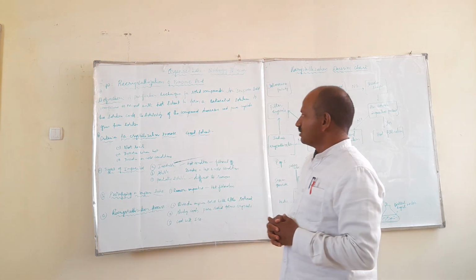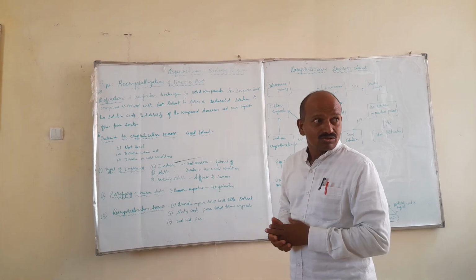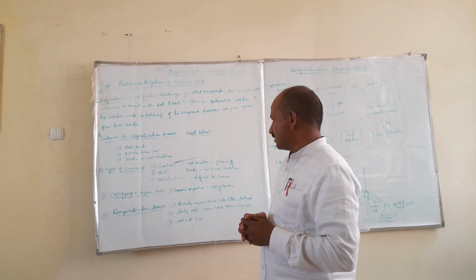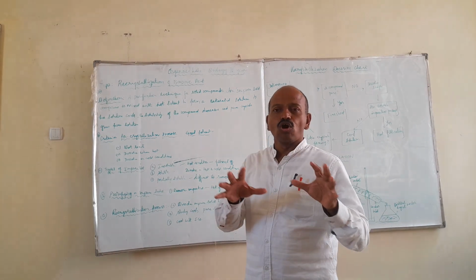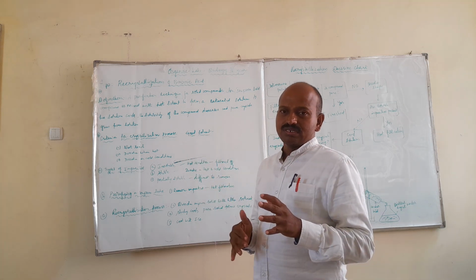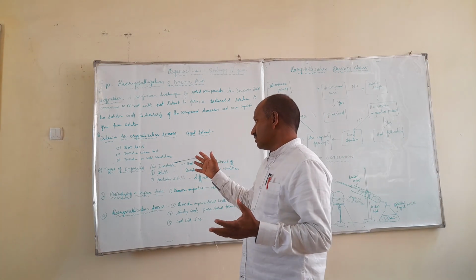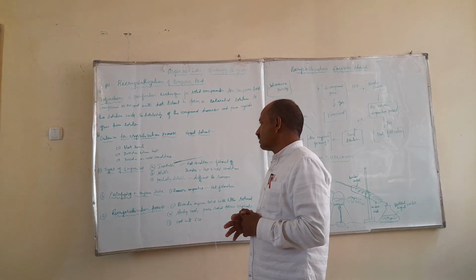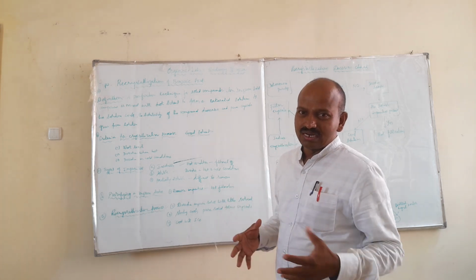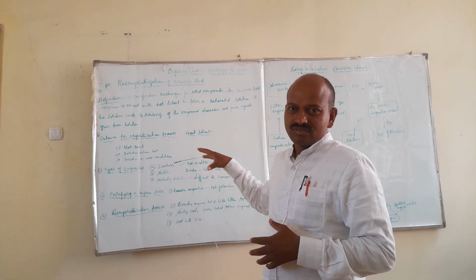Very simple technique. There are some criteria for the recrystallization process. A good solvent has some characteristic properties. A good solvent should not react with the solid organic substance at normal conditions. Another point is that a good solvent dissolves the organic compound completely at high, hot temperatures, and does not dissolve it in cold conditions. This is about the nature of the solvent.